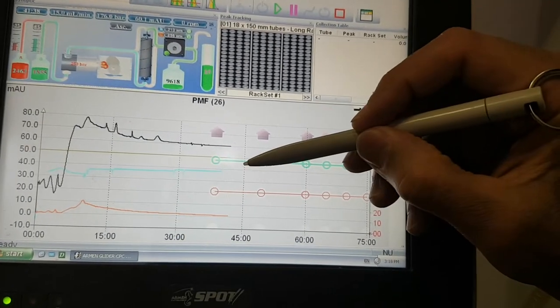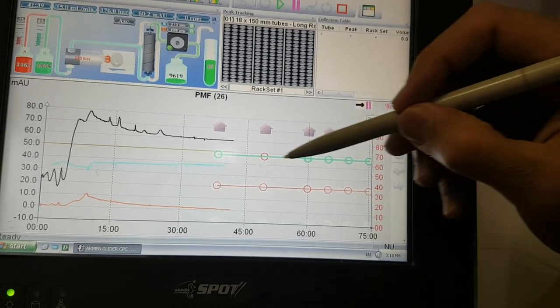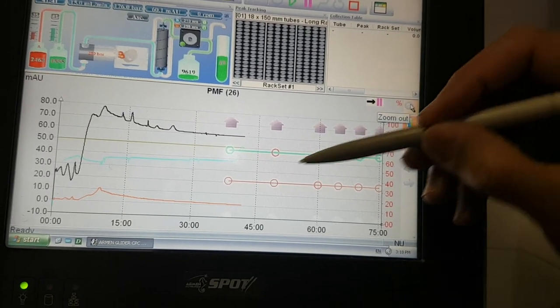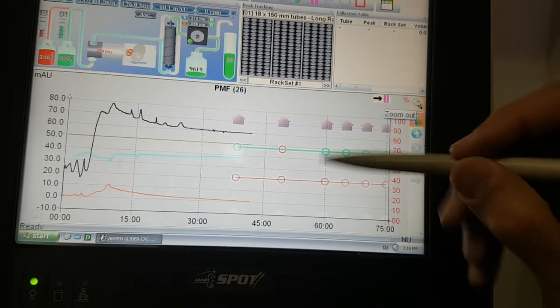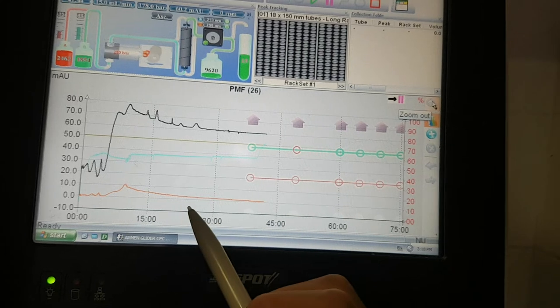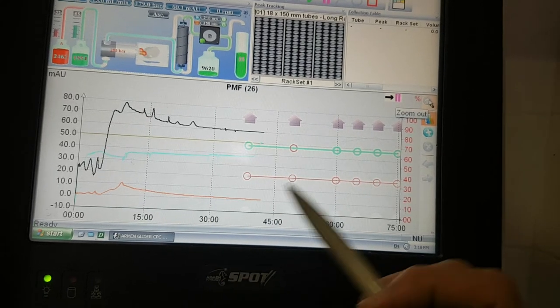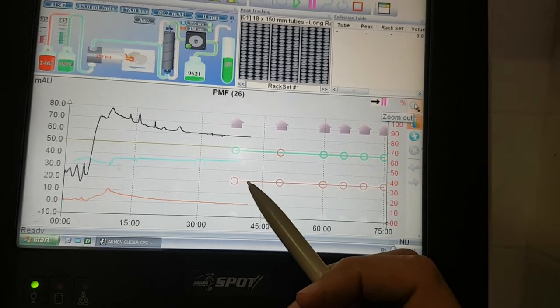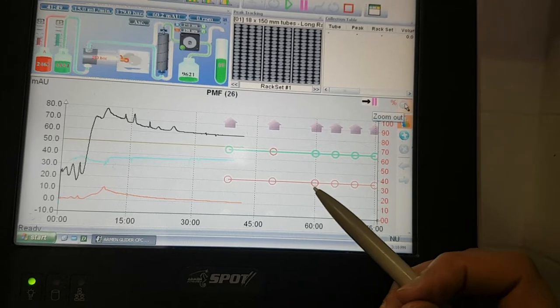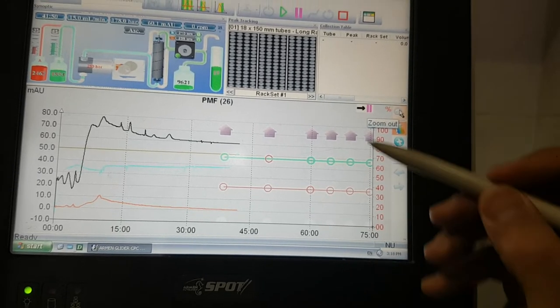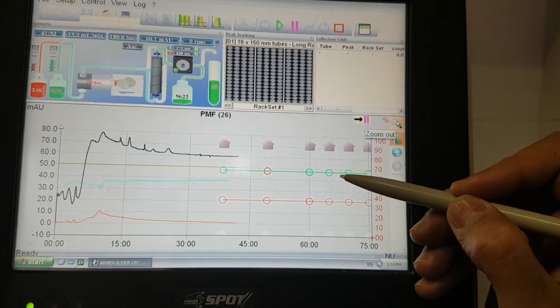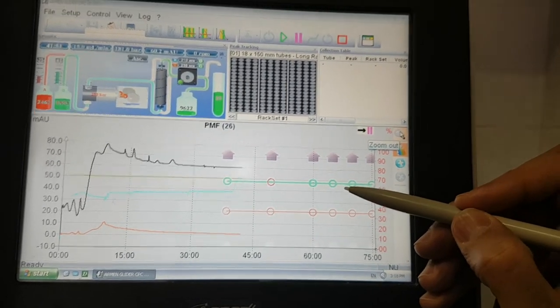Now we changed it to our elusion system. Here we were only washing with 100% methanol. Then we are using only 65% and 35% of water.